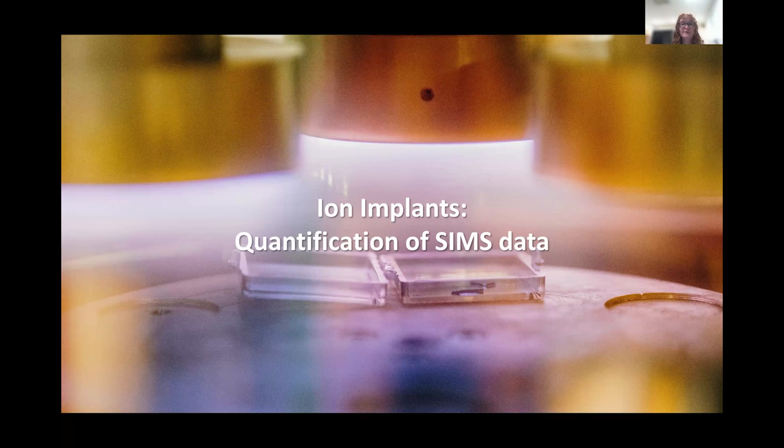Using ion implants for quantification means that we can quantify data which can then be compared from day to day, from year to year, which is really good for quality control, to make sure the semiconductor being produced is maintaining the integrity that it needs to create the device to the best quality for the industry.